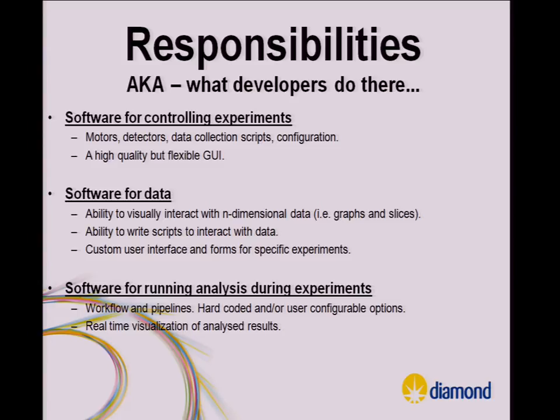And well, the final thing is it's the same maths but done in batch. So we have this capability, kind of a cluster supercomputing capability, such that we can run, typically in the macro crystallography area, known mathematical treatments on the collected data, and that will give things like, in that scenario, what would be called an electron density map, but it depends on the analysis that you want to do.